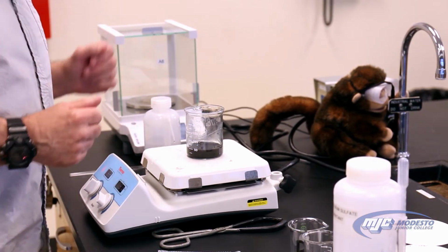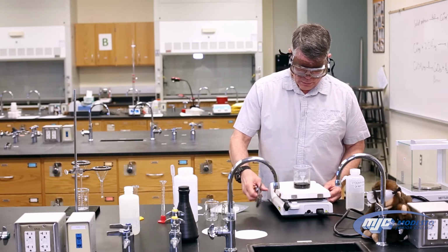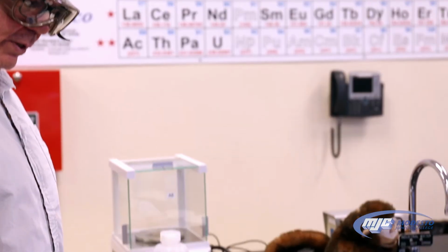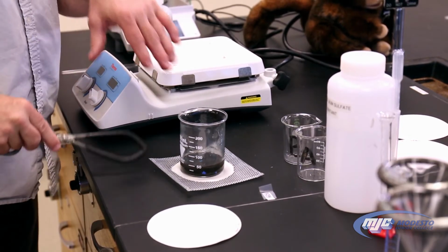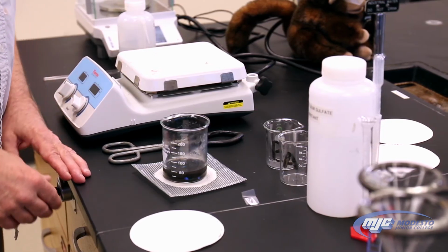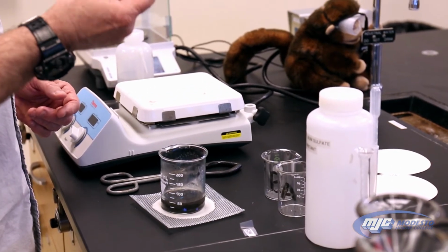Okay, so now it's done. You can see that no more blue color. I mean, my stir bar is blue, but it's all been converted into copper two oxide. That's that brown color. So we set it on here. The reason we set it on the wire gauze, by the way, is that the counter's kind of cold. We don't want the hot beaker on the cold counter. Sometimes it cracks.